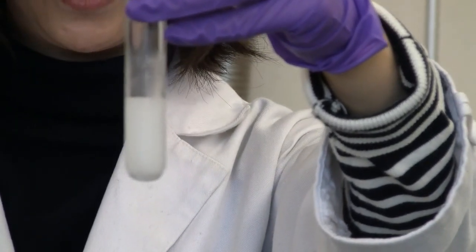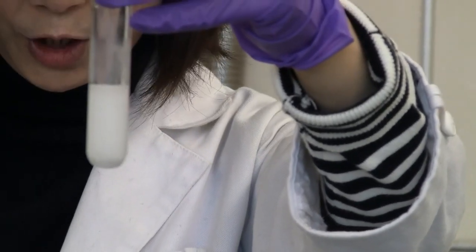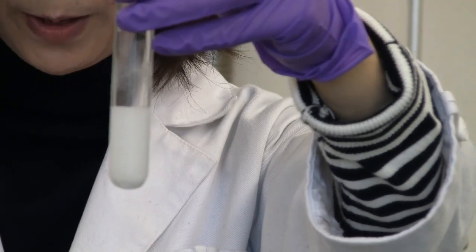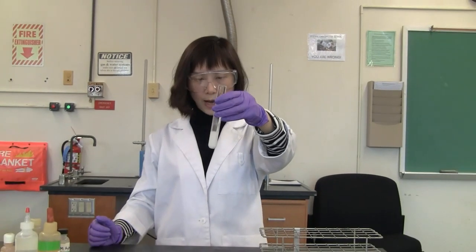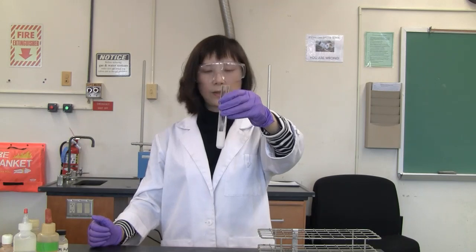Don't forget color or other observations. And look back at the equilibrium equation, decide which direction the equilibrium shifted based on the reaction and the observation, and decide what ion caused the shift.